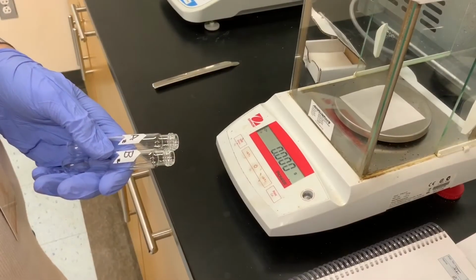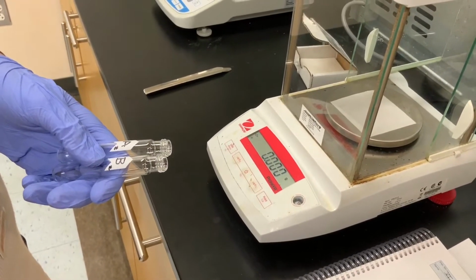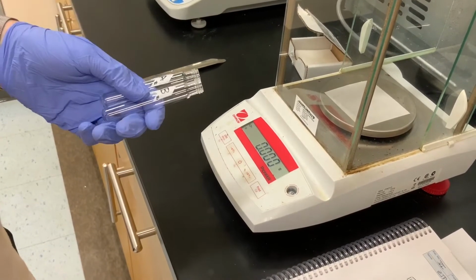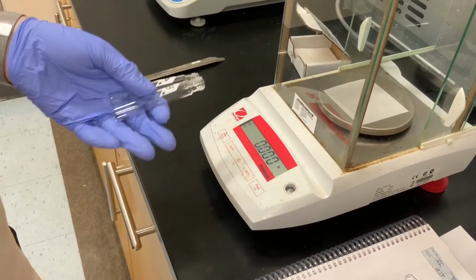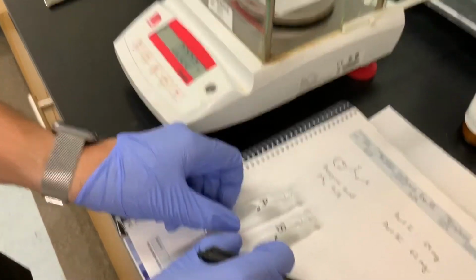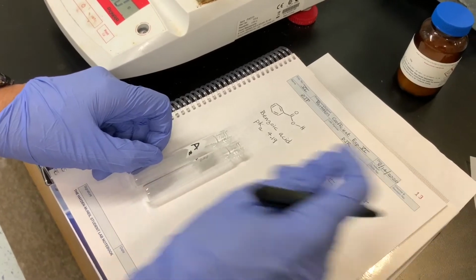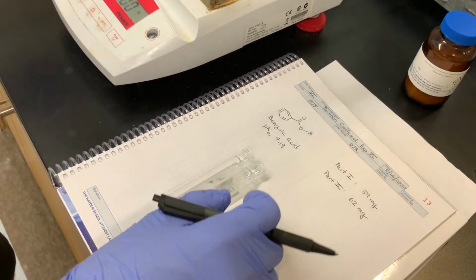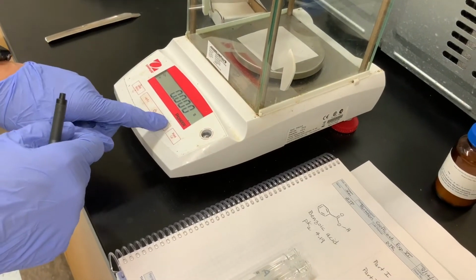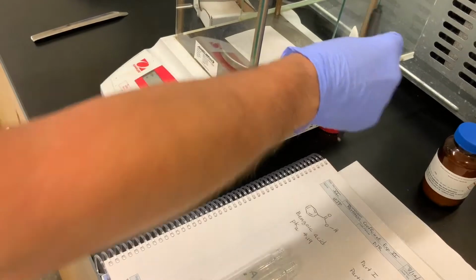All right, so while we're patiently waiting for the benzoic acid to dissolve in the methylene chloride, we can go ahead and get the tare weight of our final 2 culture tubes that we're going to label A and B. So part 1, I should have really said A, and part 2, B, but you should get that. So first thing I'm going to do, I put down a piece of weighing paper because I don't want to contaminate my culture tube from whatever might have been on the balance beforehand.